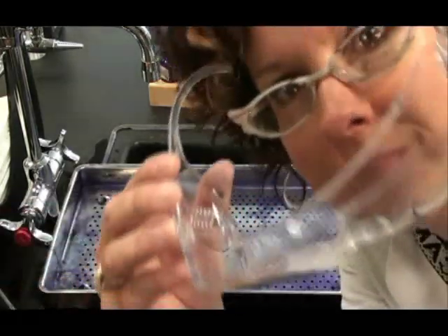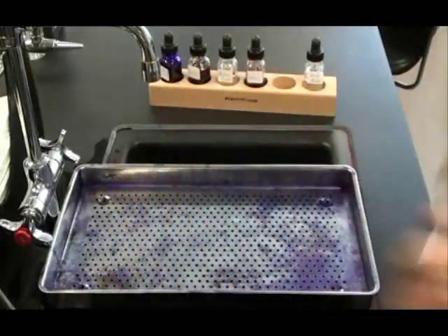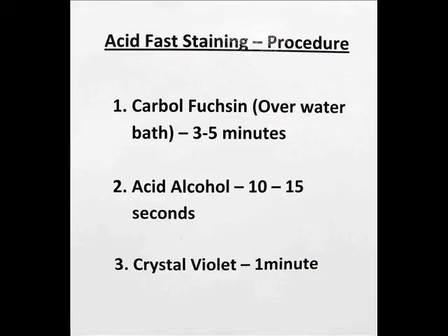First, we need to put on our eye protection. Here's our acid fast staining procedure. We start with our primary stain, Carbolfuchsin. Once applied to the slide, we'll need to heat this over a water bath for three to five minutes. This will drive the stain into the waxy acid fast cell walls.